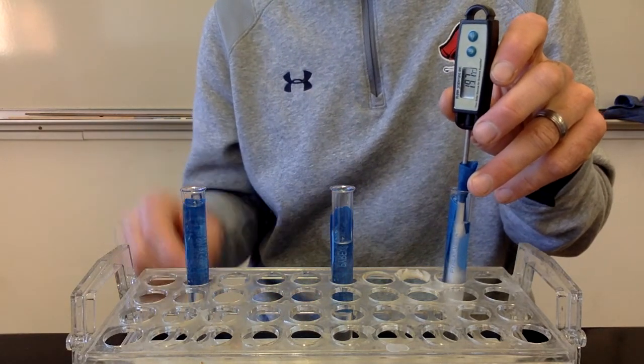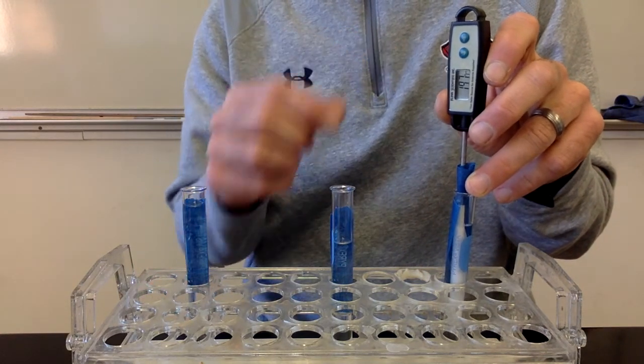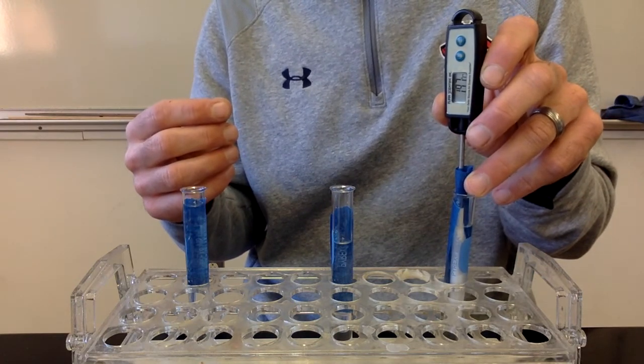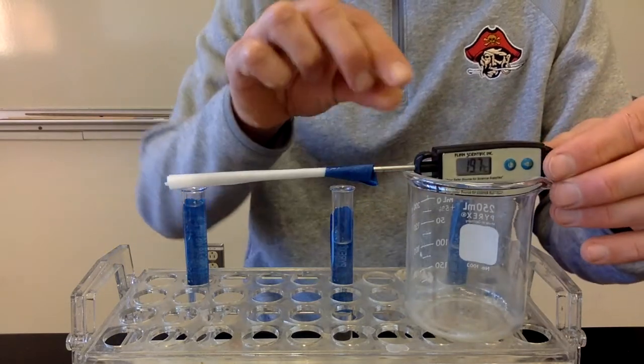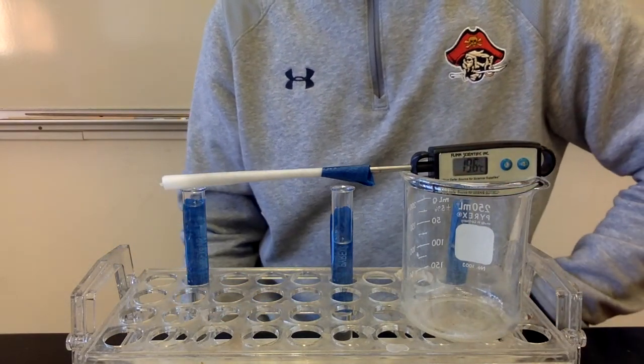And so we'll pull that out, and you're going to record the temperature every 30 seconds. You need to start a stopwatch when I pull this out. Your temperature at time 0 is going to be 19.7, and then every 30 seconds after this, you're going to record another temperature. All right, so we'll pull that out, set it up like this so you can see it. And every 30 seconds you need to record the temperature.